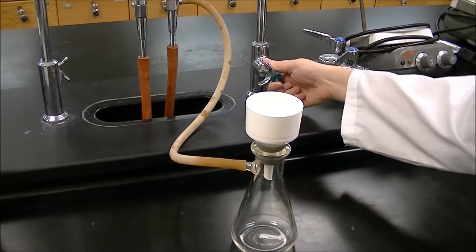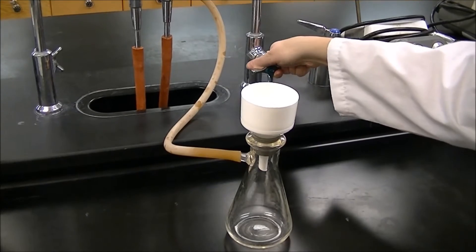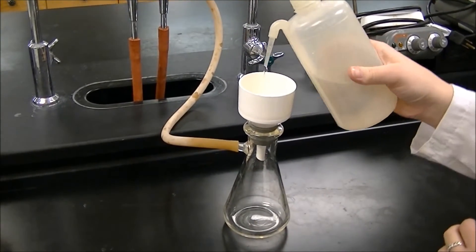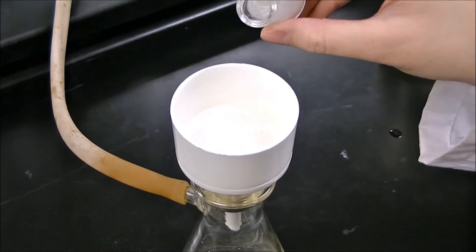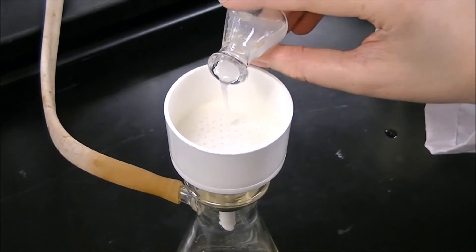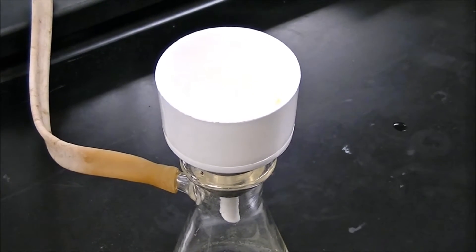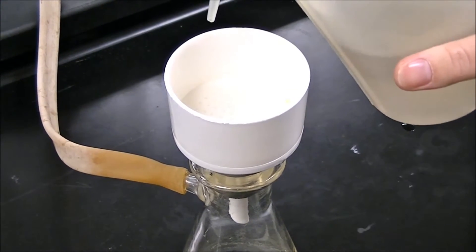Start by turning on the water to create a vacuum and lightly wet the filter paper with distilled water. Now add the aqueous solution to the filter. When all the water has been filtered, wash the filter paper with water.